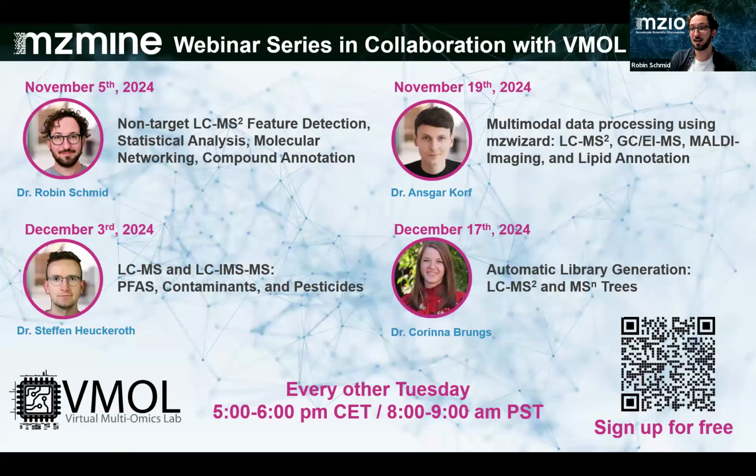And as already introduced, we have a series for mzmine. There are many different topics that we want to cover, and I am going to introduce mzmine first, the basics, leading you through how to start with the software. I'm going to do this with non-targeted LC-MS analysis, feature detection, and then also integrating statistical analysis, molecular networking, and compound annotation, everything in mzmine.